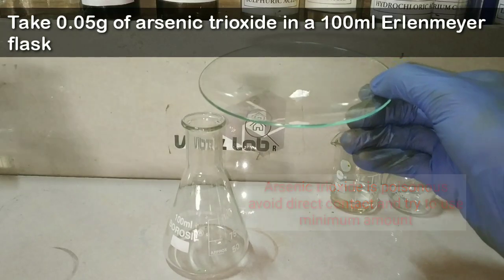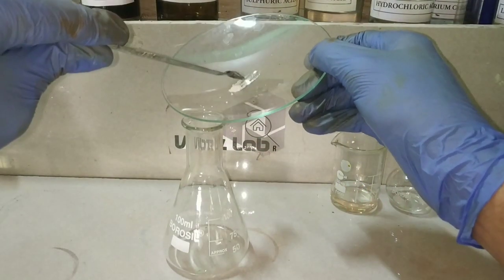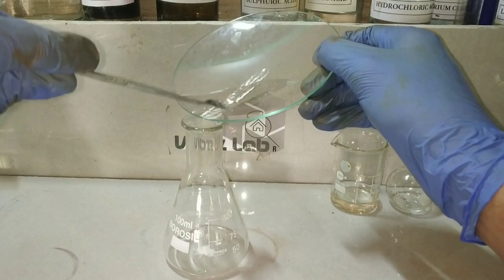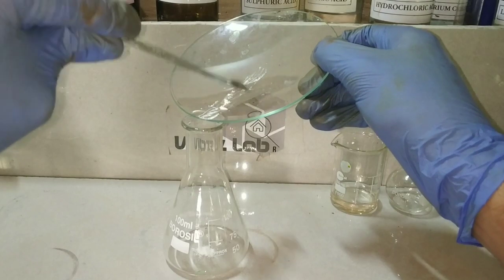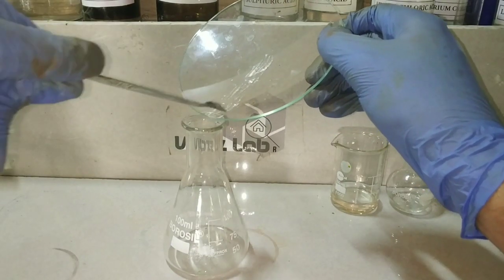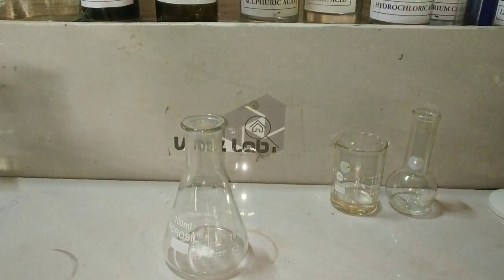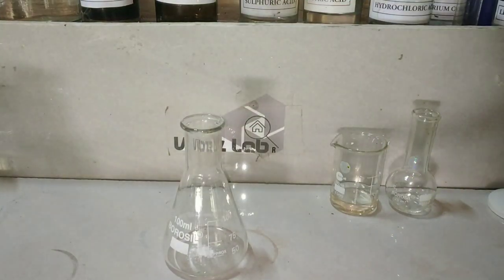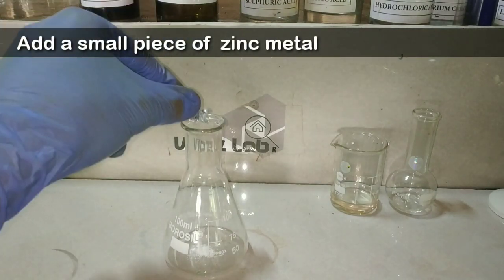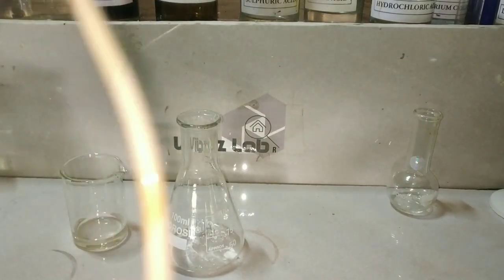We take a very minimal amount — here I am only using 0.05 grams of arsenic trioxide. Arsenic trioxide or any other arsenic compounds are highly poisonous; try to use as minimum a quantity as possible and avoid direct contact. Also, don't throw away any of the waste materials into the environment as it is highly hazardous. Now into the arsenic we add a small piece of zinc metal.